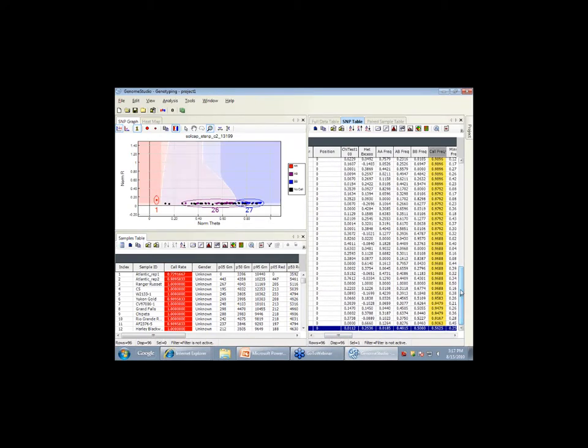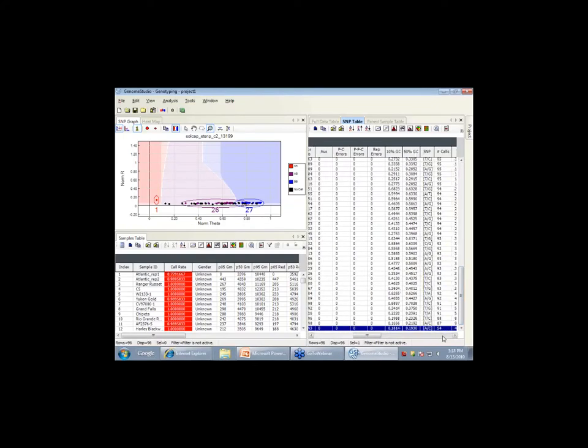That's not the allele frequency. The call frequency and the chi-square are not directly related, because you may have called only 50% of that data, but that data might still be in equilibrium, 1:2:1. You only have 50 samples now instead of 96, but there's 12, 25, and 12, to give you a high chi-square in this case. So they're not related at all, actually.